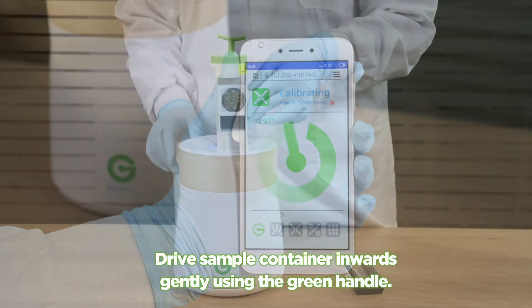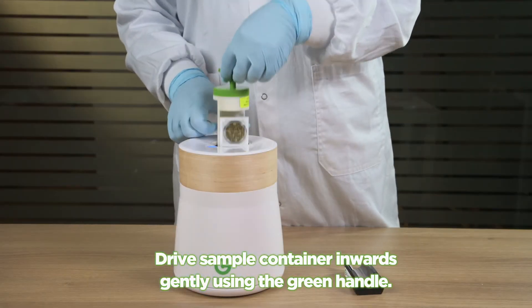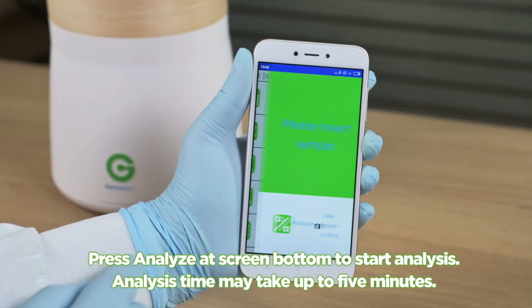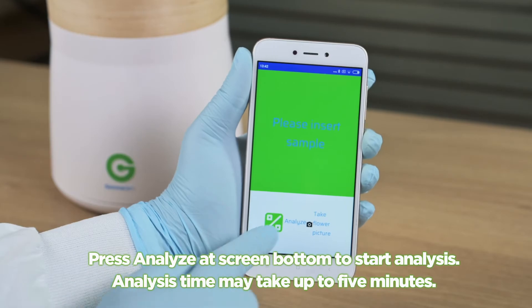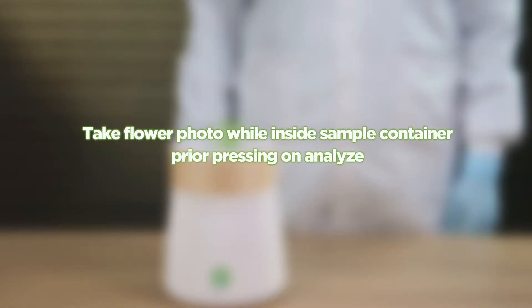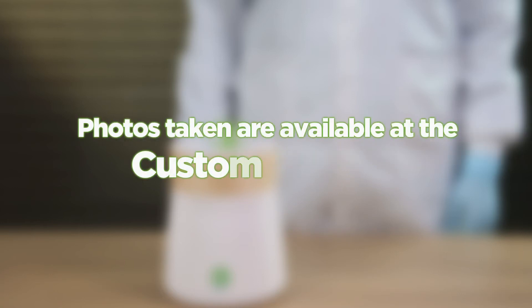Drive the sample container inwards gently using the green handle. Press Analyze at the screen bottom to start the analysis. Analysis time may take up to five minutes. You may take a flower photo while inside the sample container prior to pressing Analyze. Photos taken are available at the customer portal.